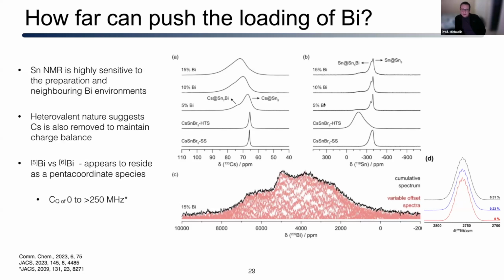The issue is this group often needs a single crystal, or they need the ability to make a thin film. When you start doing these different treatments, whether it's solvent synthesis, mechanochemical synthesis, or high temperature, we often get powders or large crystallites. And so they can't necessarily analyze the hole densities. So I can't answer that question, but it's definitely possible.